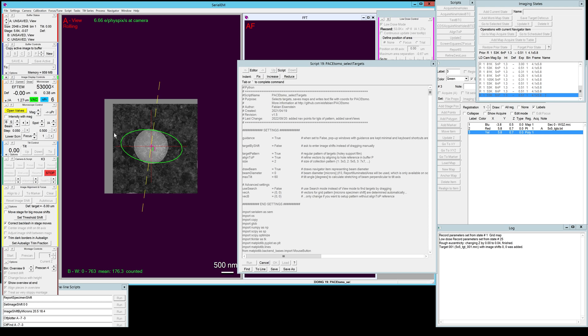We do see that we have the beam diameter drawn in here.